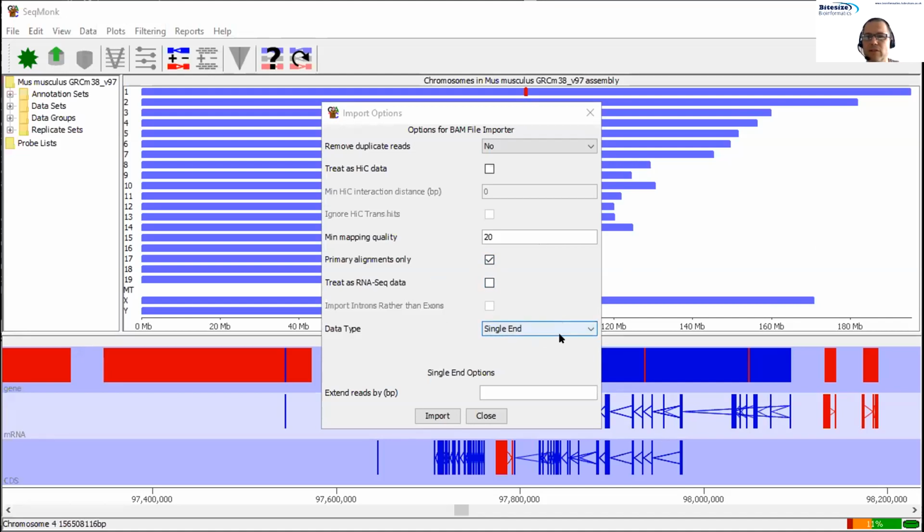Finally, it will look at the type of library. There are two types of sequencing you can do on most sequencers, which are either single-end sequencing or paired-end sequencing. And this simply says that if you have an insert that you're sequencing, you can either sequence it just from one end, or you can have a pair of sequences where they sequence from opposing ends, and you get two.